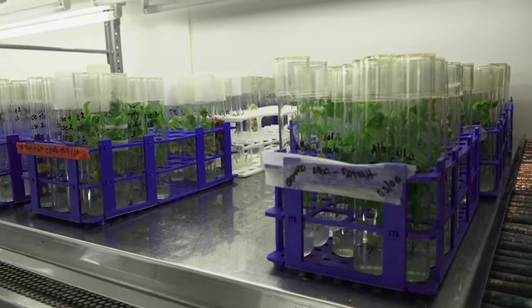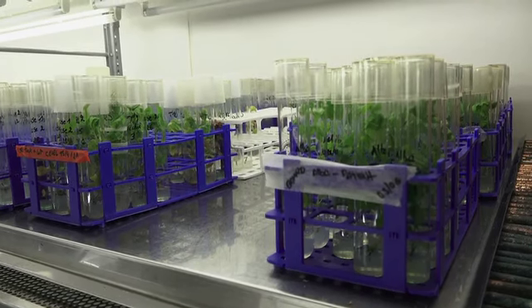Because one of the difficulties with these programs is that they're based on mammalian cell line data, and they're not readily transferable to plants. It's very difficult to predict. So at the moment, I'm working with an array of 6 different guide RNAs cloned in one array, and for one of the guides we have 0%, for the other one 75%. So it really depends a lot on the guide that you actually use.